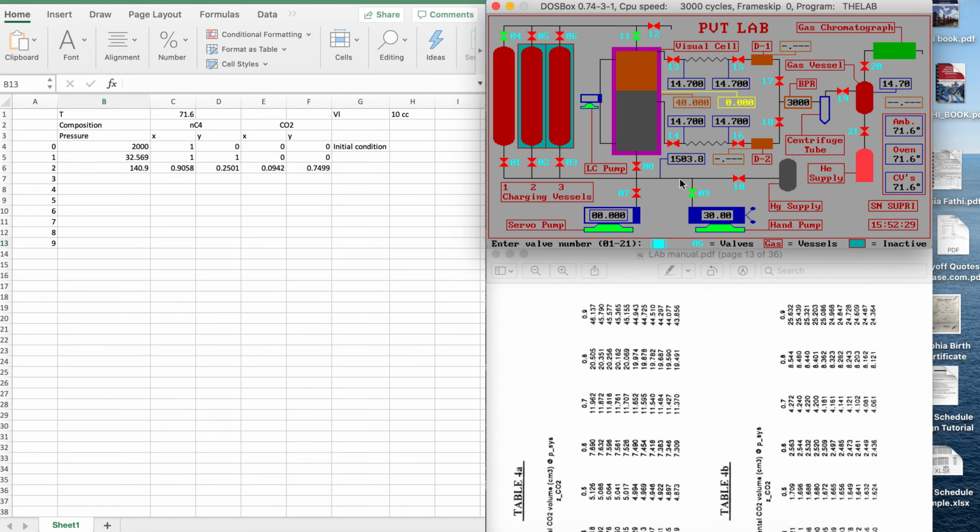I'm going to close, and I'm going to open valve 10. Okay, so my hand pump is full. So I got 30 cc's out. I'm going to place that 30 cc's in my mercury supply. So I'm going to empty my mercury hand pump to the mercury supply. So I got 30 cc's out and I stored it in my mercury supply.